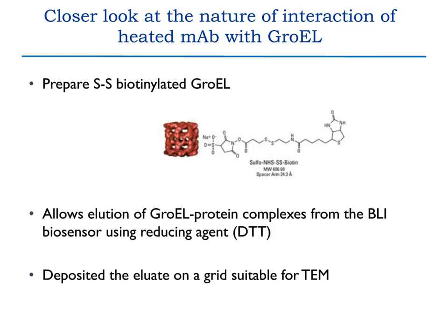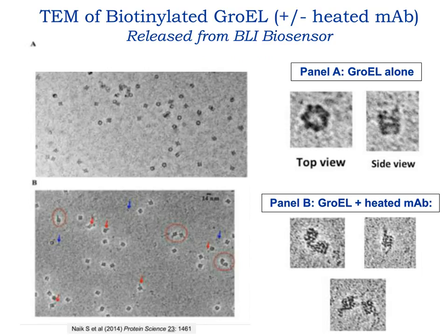And in the final data slide, I highlight for you the TEM analysis of the biotinylated GroEL complex, plus or minus the heated mAb. And you can see on the top, this is GroEL alone, and on the bottom, we have the GroEL complex in the presence of the heated mAb, and this is highlighted on the right. We can see some complexation of GroEL with what appears to be an aggregate, and we do not see those species on the top. We're currently trying to better understand this system with experiments in the lab today.